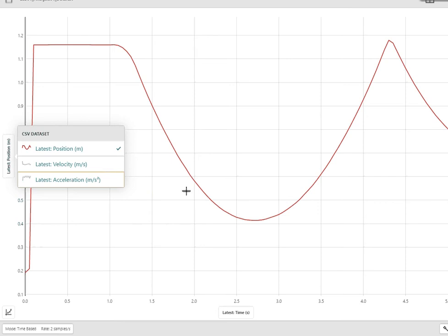Okay, so that's pretty handy, right? Because now I can see the whole screen devoted to that one graph.